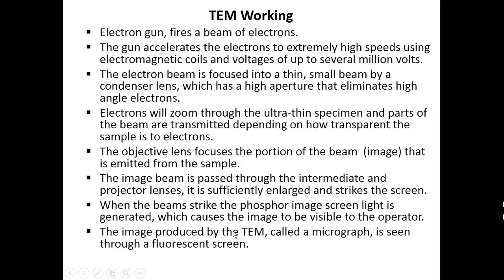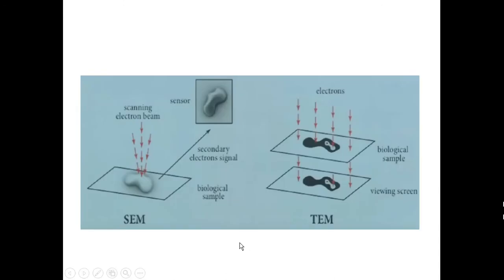The image produced by the TEM, the transmission electron microscope, is called a micrograph, and it is seen through the fluorescent screen. Now, I told you already the basic difference between SEM and TEM.